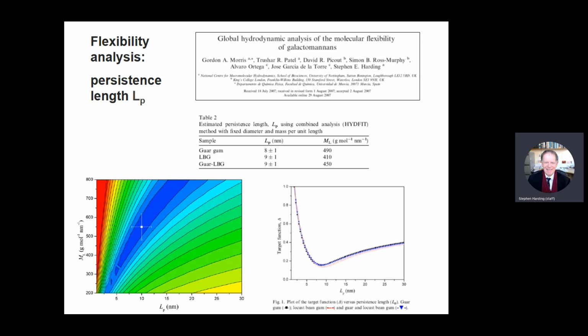So we'll do this in some more detail. But when we do the polysaccharide structure next week, we'll go into this a bit more. All this has been a quick overview in about an hour of what these different techniques do. We've done viscosity in some detail already. We'll also do the ultracentrifuge in more detail when we do the antibody structure. And then when we do the group mini projects, you'll see how the DLS and SEC-MALS give information about molecules.